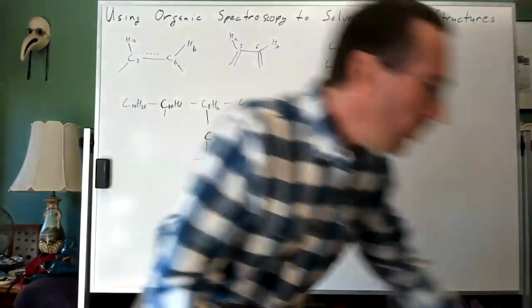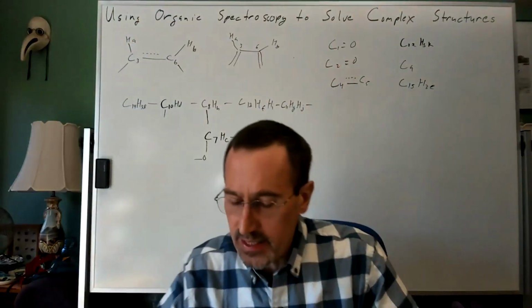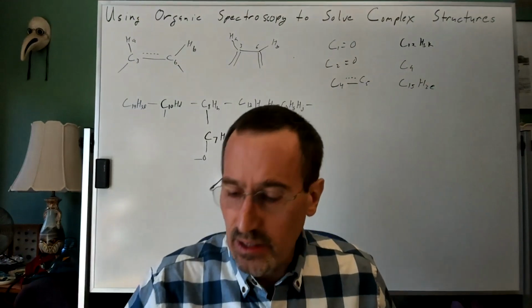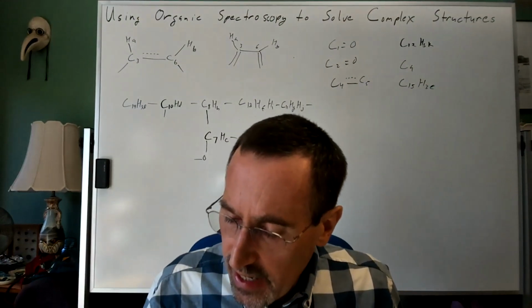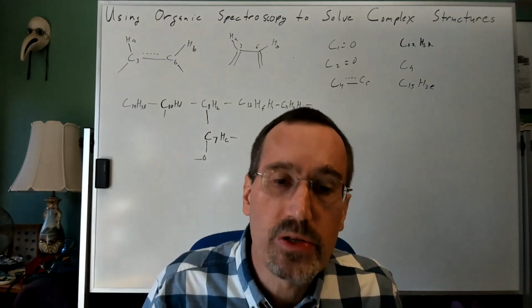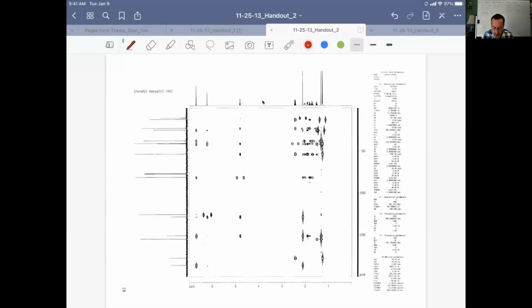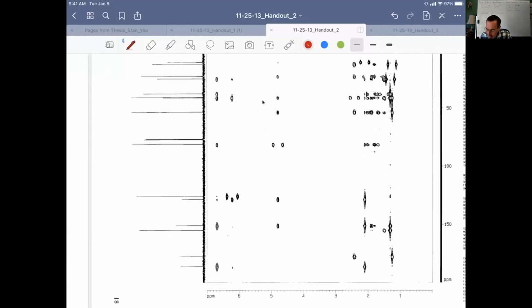All right, at this point, I want to turn our attention to the HMBC. And as I've said on quite a few occasions, HMBC can be like drinking from a fire hose. You have a lot of information there. But we're going to start with our carbonyls and our quats, our carbonyls and our isolated methyls. And honestly, that's usually enough to get us where we're going.